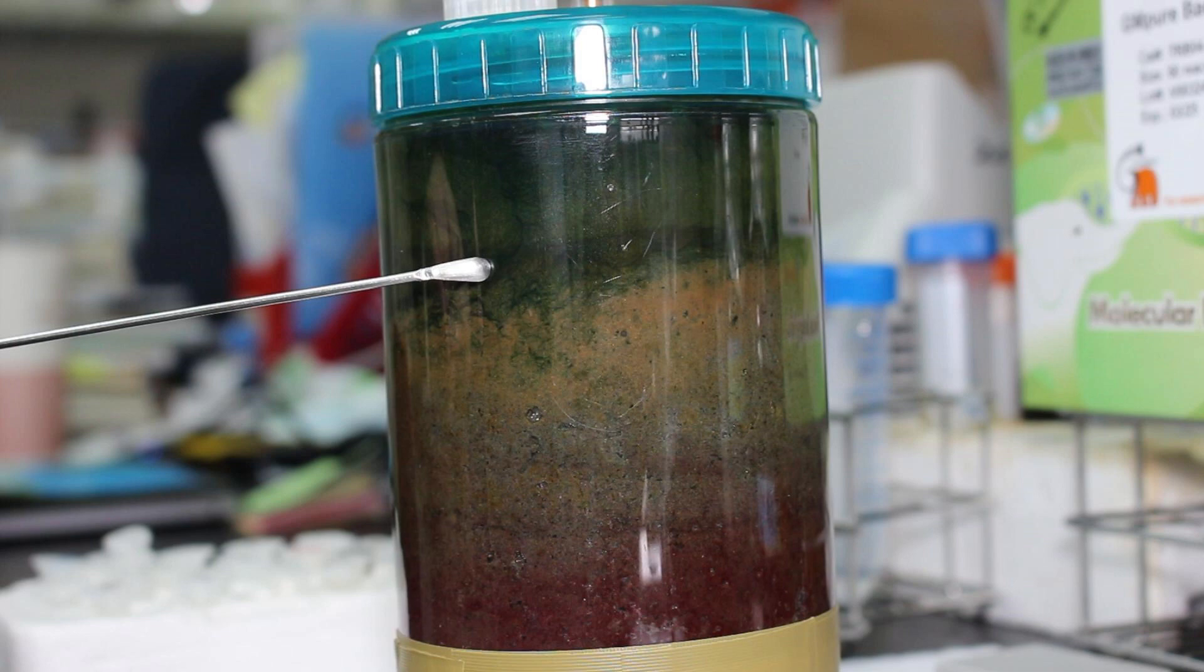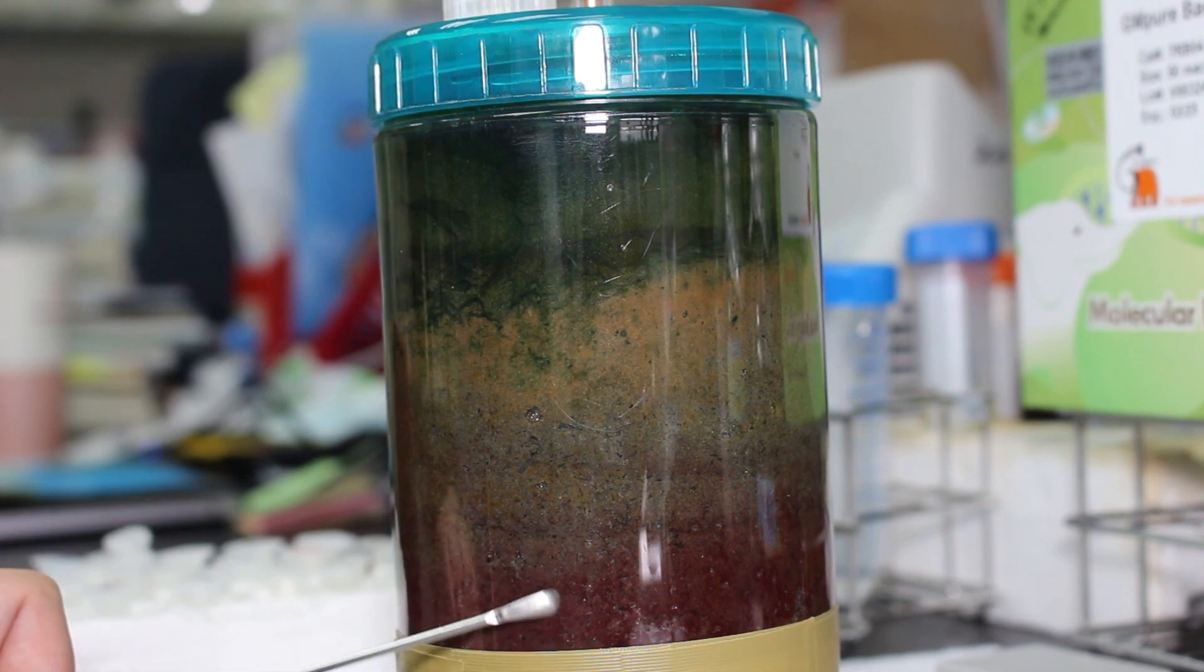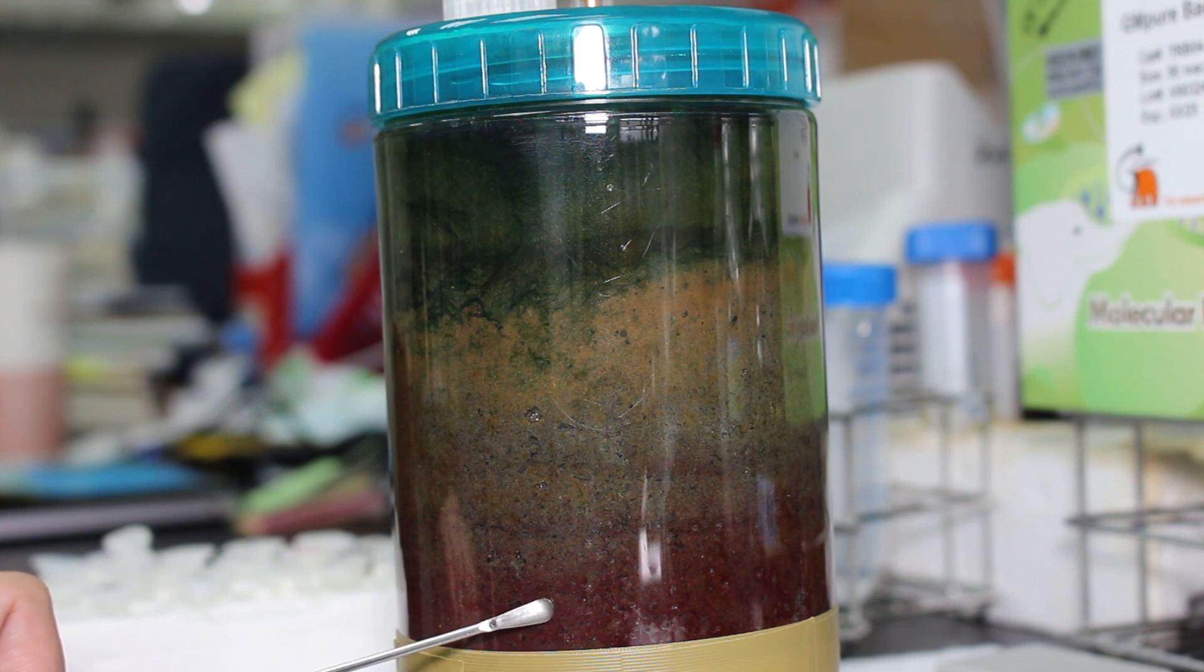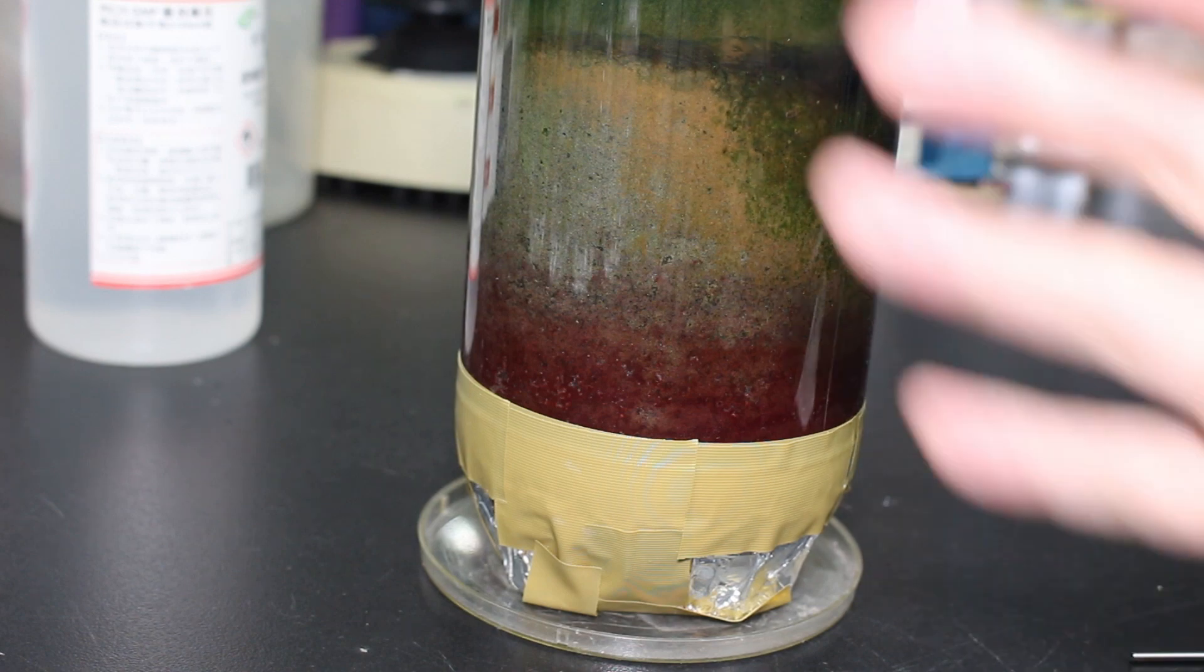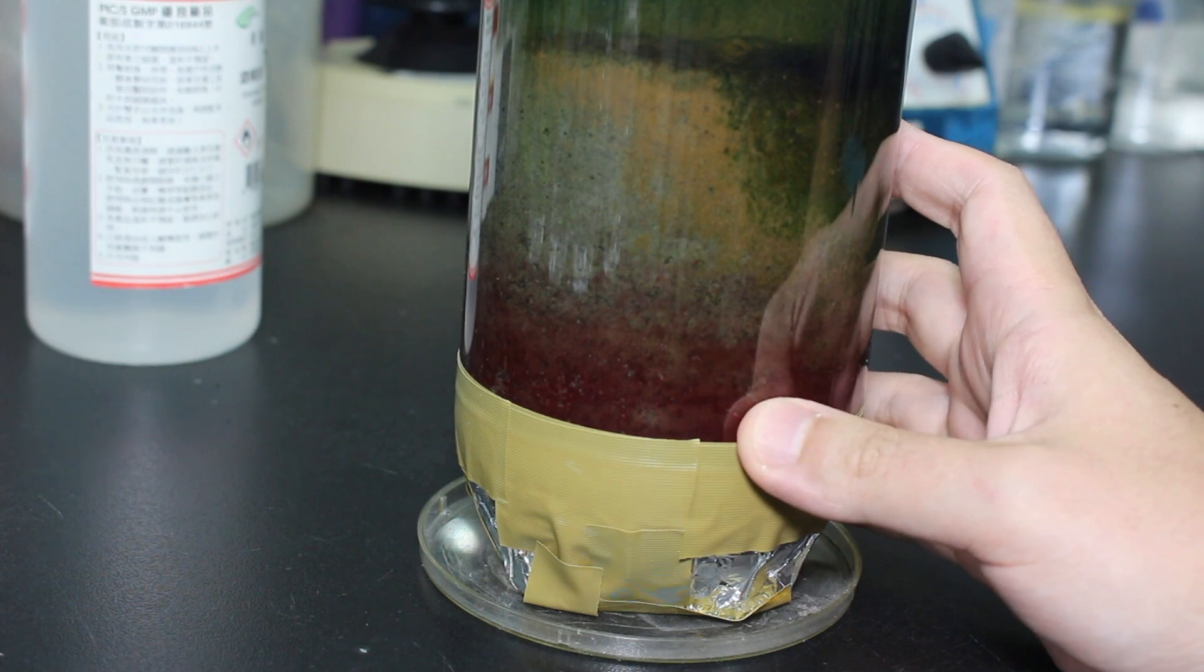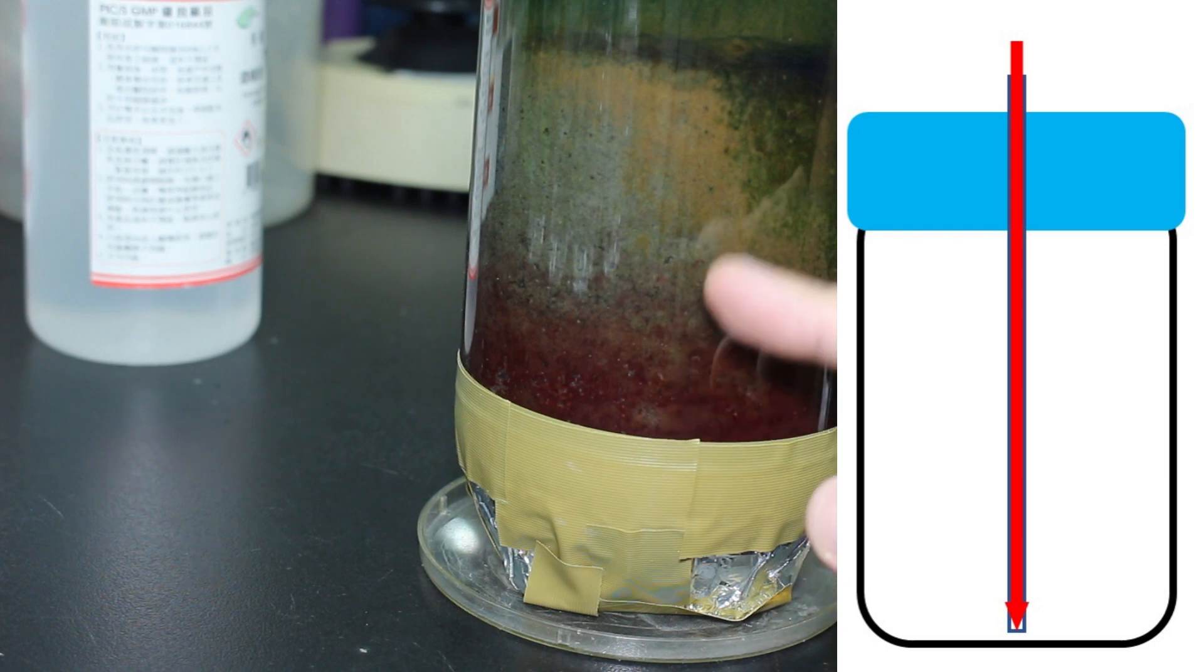In the future, I will also try to raise something in this area. According to my previous experience, the area that has higher oxygen level will enlarge because of the nutrient at the bottom of the column slowly depleted. If the nutrient at the bottom depletes, then the supply of hydrogen sulfide will also decrease. Once the hydrogen sulfide decreases, cyanobacteria or algae can grow downward. And when they grow to other parts of the column, they will start producing a lot of oxygen. To my previous experience, this red layer will become smaller and smaller and then kind of disappear. That is why I designed this small hole to try to add new nutrients to the bottom. I put a column all the way to the bottom of the bottle.